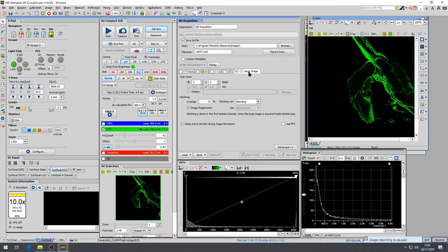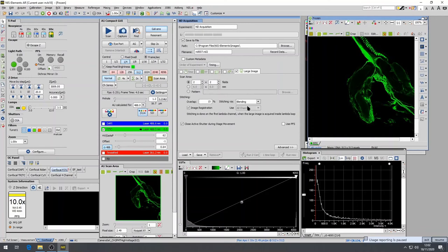Stitching is available and this is the process in which the program automatically overlaps and pieces your images together to give a final image. You can choose to select this process by selecting Stitch or Do Not Stitch. If you do not select stitching, images will be placed side by side in order of the capture.